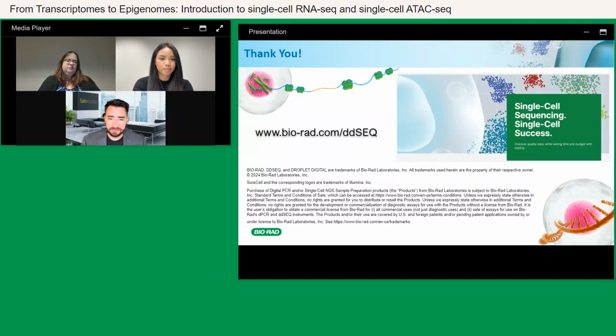Awesome. Thank you so much. All right. Moving right along. Can you get information about immature and mature RNAs from Omnition? Yeah, so I'll go ahead and take that question.